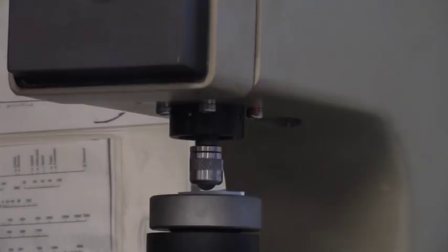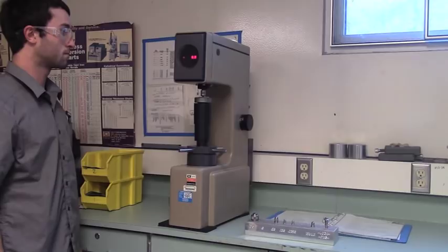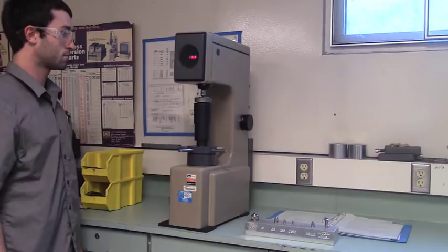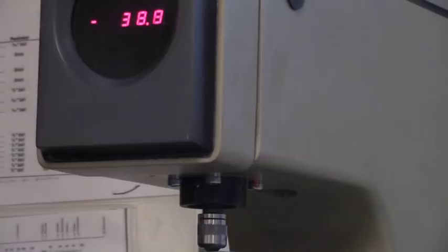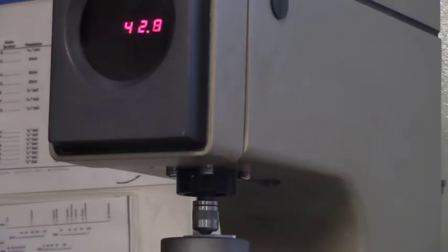Wait for the machine to cycle. As the machine cycle is run, the output will begin dropping in value to a negative number. It will then increase to a positive number and stop. If the machine does not go to a negative number, the cycle is done incorrectly. Once the number on the machine output has settled to a value, the cycle is done. This is the Rockwell hardness value that corresponds to your chosen scale.